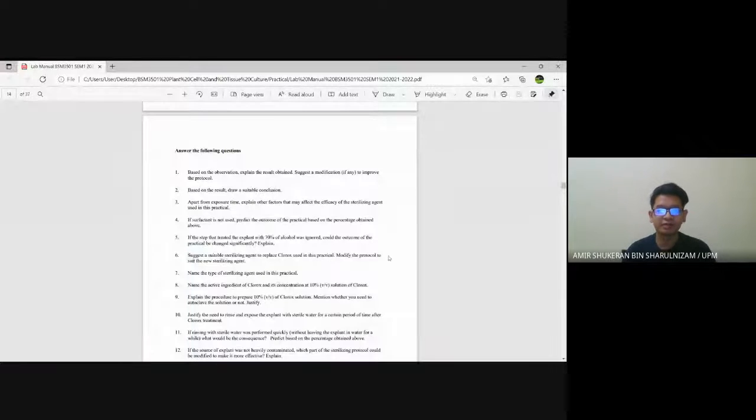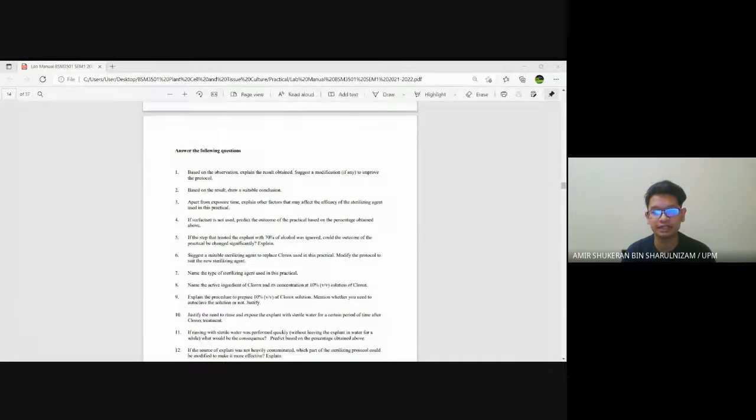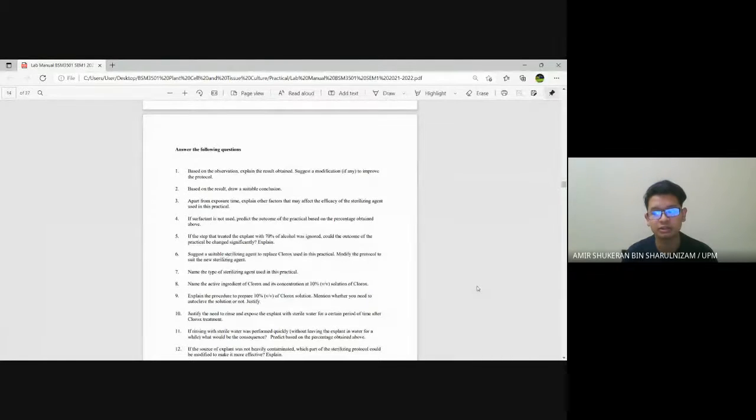I think there are several factors that may affect the efficiency of the sterilizing agent, which are the concentration of the sterilizing agent, the type of leaf surface, and the presence of organic material.